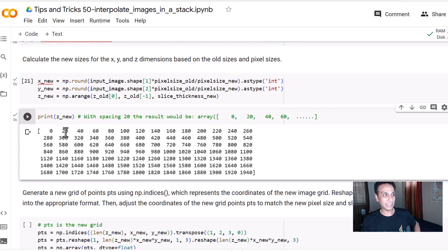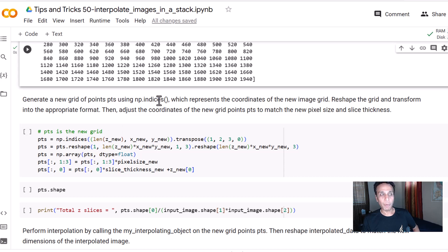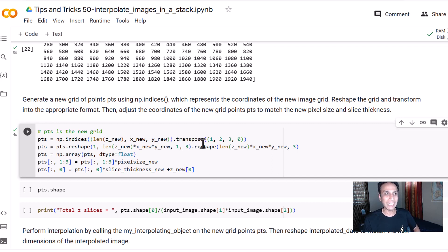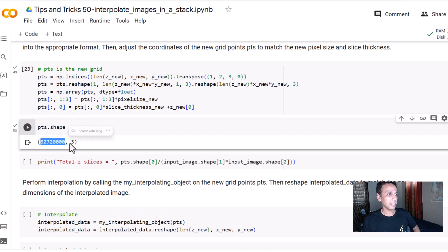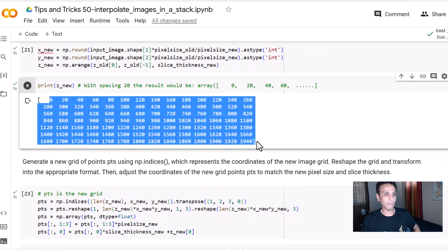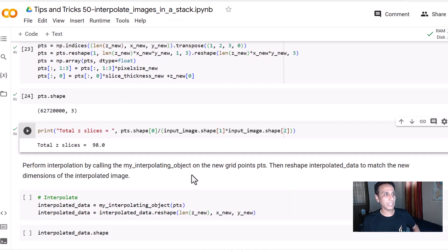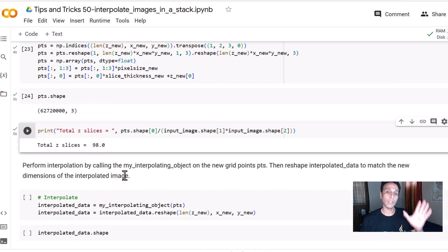Now let's generate a new grid of points using np.indices. These represent the coordinates of the new image grid, then we interpolate and reshape. Looking at points.shape, it should be 800 multiplied by 800 multiplied by however many slices we end up with. Dividing by 800 by 800, we confirm we get 98 — so our output image will have 98 slices.